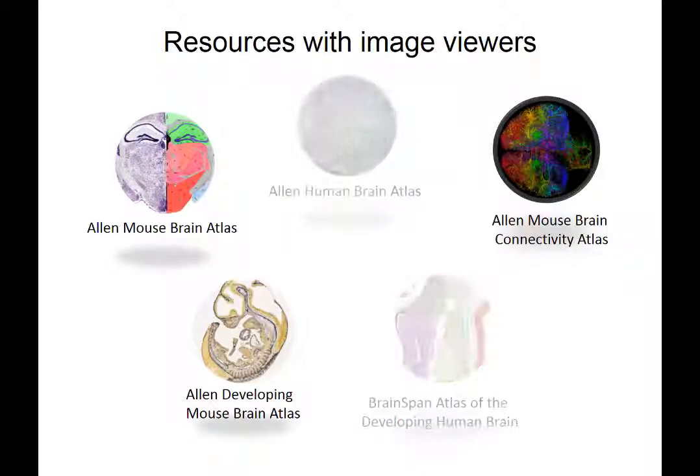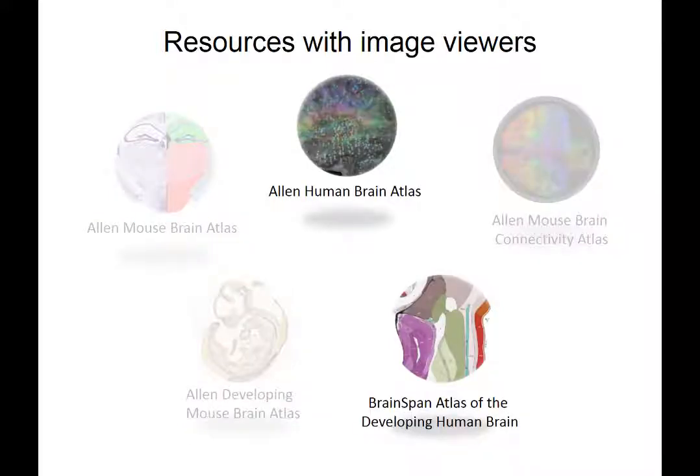Let's start with the mouse image viewers, which are registered into the Common Coordinate Framework, before we look into the human image data viewers, which have a different way of determining the spatial location in the brain.